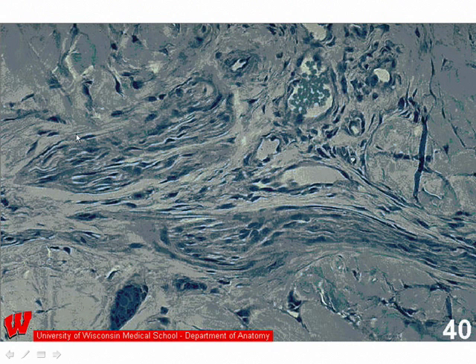What I would like you to look at in this particular slide, in this longitudinal section of a peripheral nerve bundle, is that this is a structure which is surrounded by perineurium. So this is now a medium or intermediate magnification light micrograph. You can certainly see nuclei.